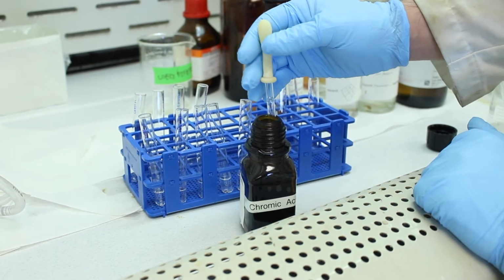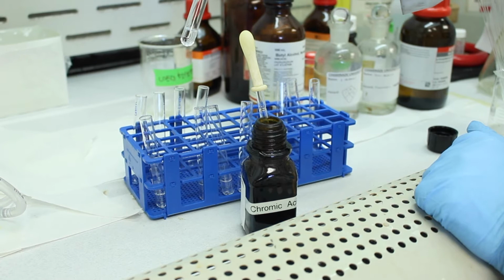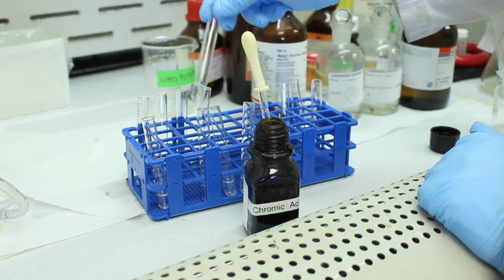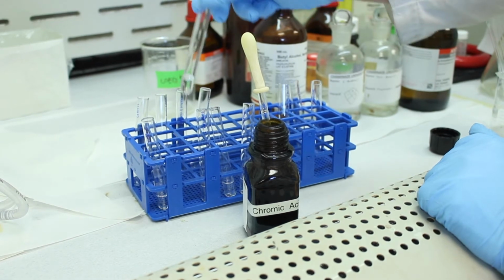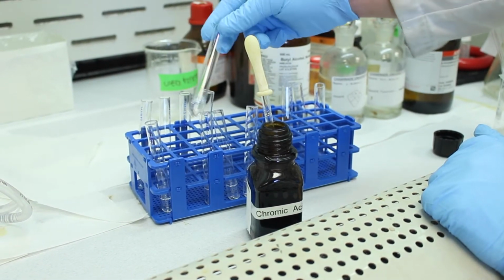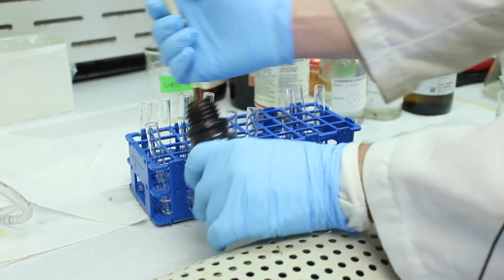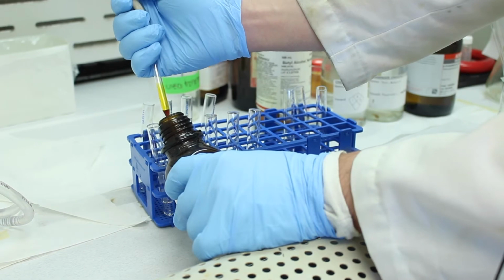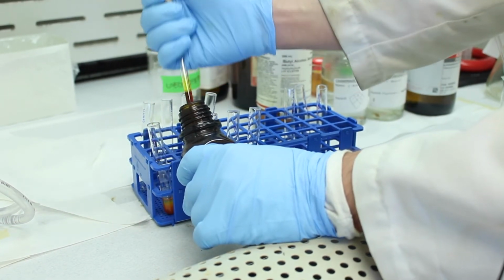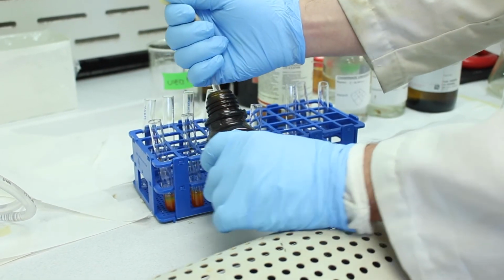So what we're going to do is add some to these vials. These vials have some acetone in them. Acetone is the solvent, and it's important to use reagent grade acetone because some acetone is contaminated with perhaps a little bit of isopropanol, and that isopropanol will give you a false positive. So you need to use the pure reagent grade acetone here. Okay, and we're just going to add some to each of these. So we'll just add a little bit. You don't need very much to each test tube.